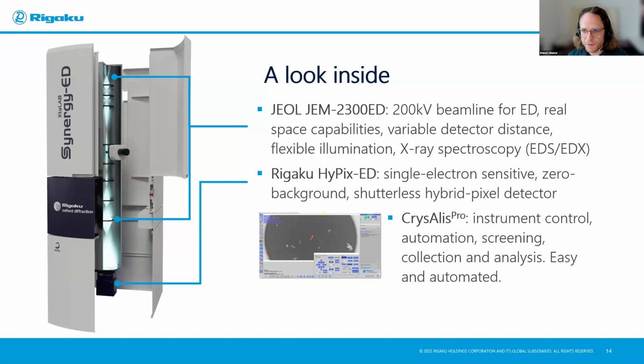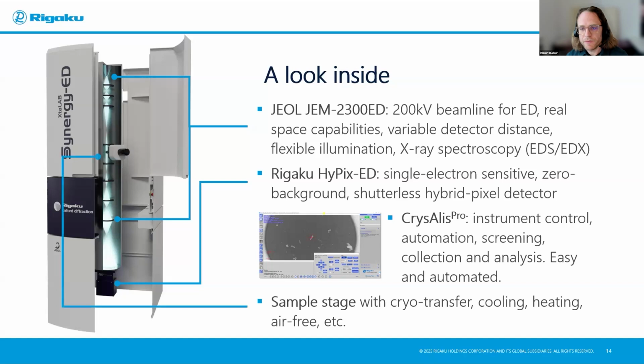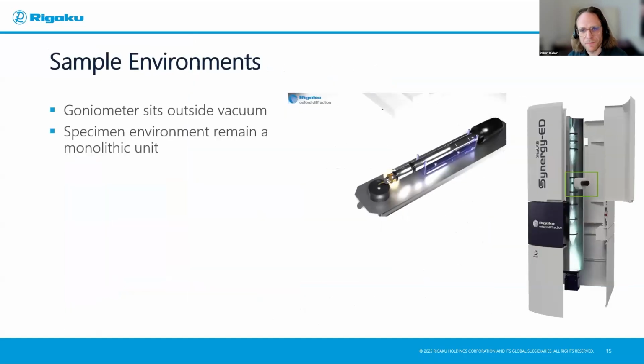It controls every aspect of the instrument, of the measurement process, of the data management, and so on, and will be especially easy for everyone who's worked with a Rigaku instrument before. And we have a sample stage with different kinds of sample environments, and I want to talk about this just a bit because it's also something that's of course quite different from X-ray.